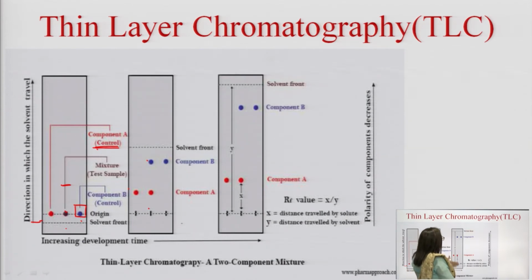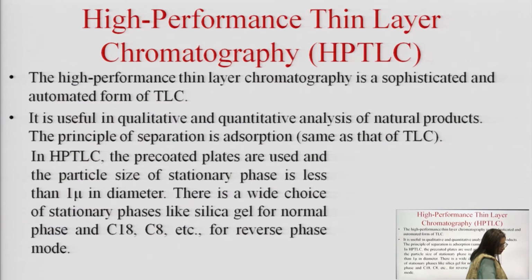So, the substance that is extracted is in this series of polarity. Okay. So, the next topic of discussion is the high performance thin layer chromatography, which is also termed as HPTLC.